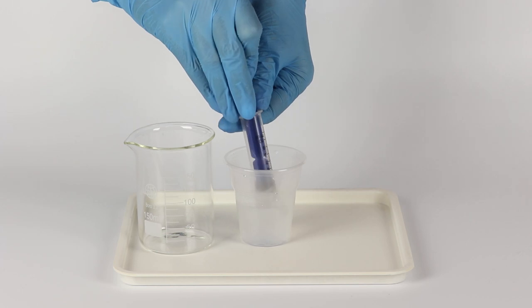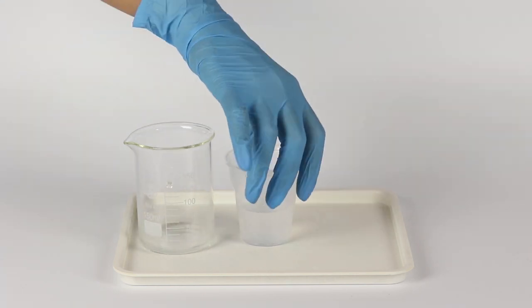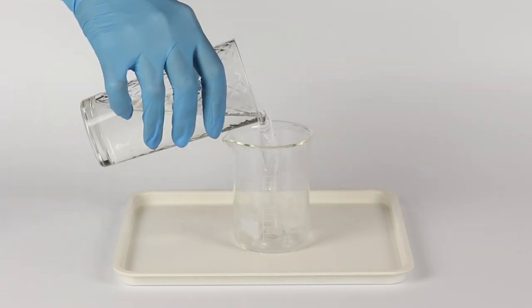Transfer five milliliters of the starch solution to the beaker using a syringe. Fill the beaker with cold water up to the 75 milliliter mark.